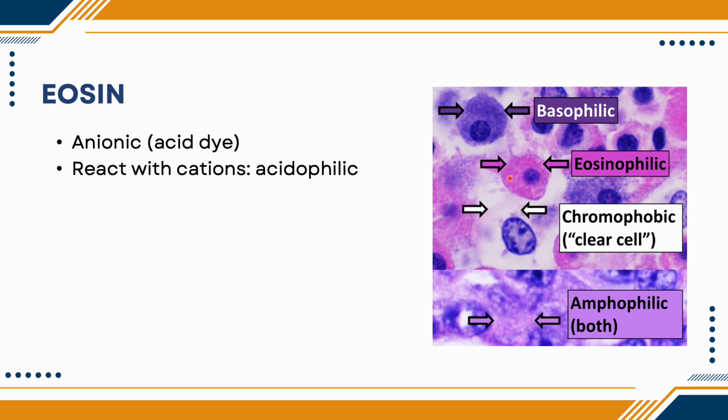So, this image is what we refer to as an eosinophilic structure. Bakit siya eosinophilic? Because it has a high affinity for eosin. Ano ba yung mataas sa cytoplasm? Proteins. And some proteins are very rich in amino acids which are typically basic. Because it is basic, then it would have an affinity to acidic or anionic dyes. Kaya, it would have an eosinophilic appearance, and those structures are also acidophilic because they are basic. They love acid. Acidophilic.